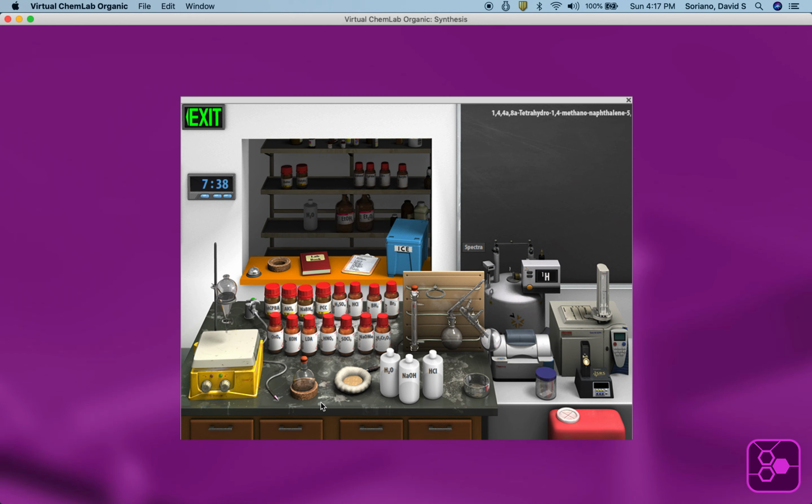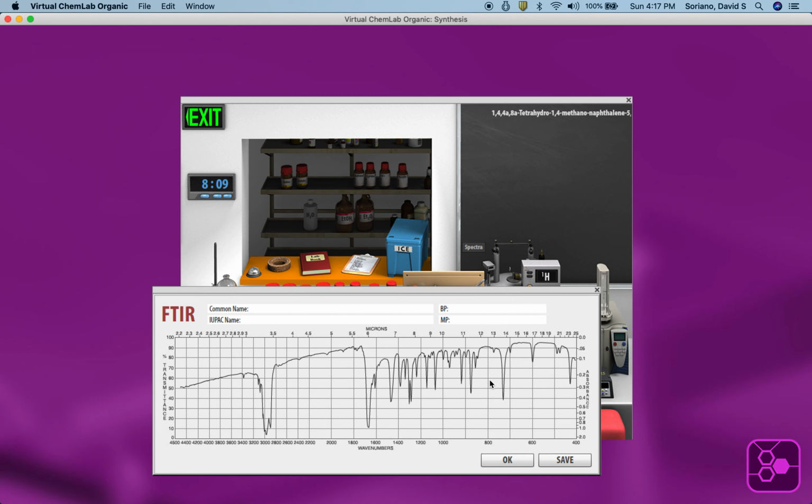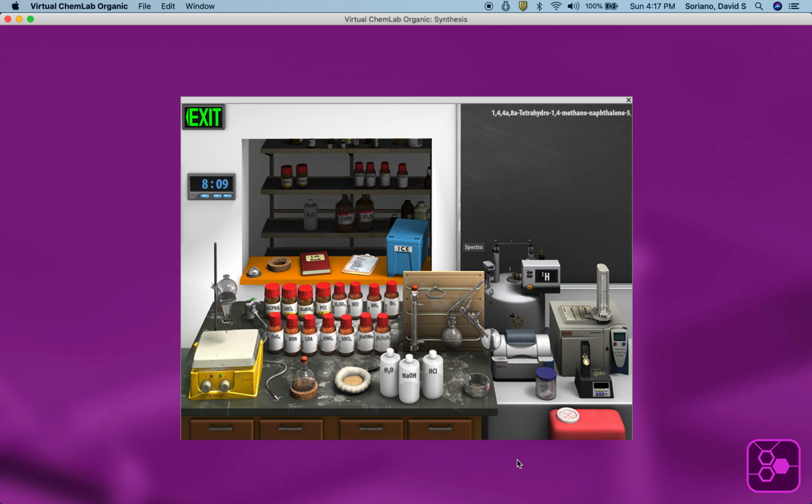Now, by me moving that over, that ether has been rotovapped off because that's a solid product that you're going to get. So let's do an infrared, and there's the infrared of the product. Normally I would have students look that up in the SDBS structural database online, where you can retrieve spectral data. You could put it in the notebook, but I'll just exit out.